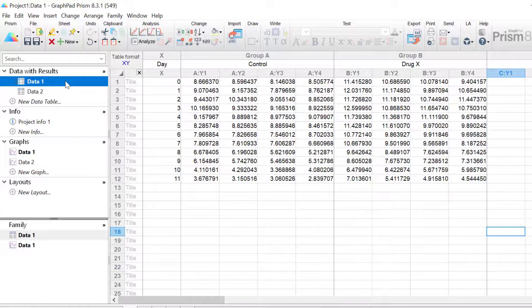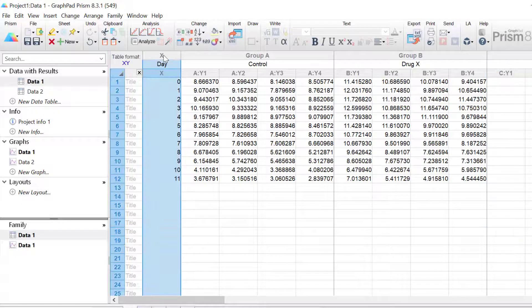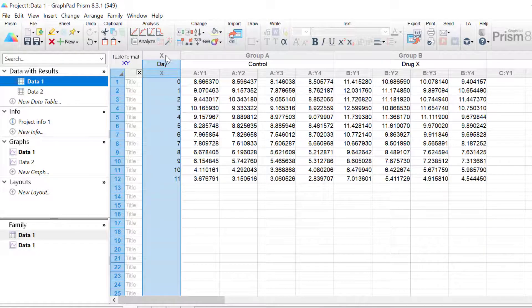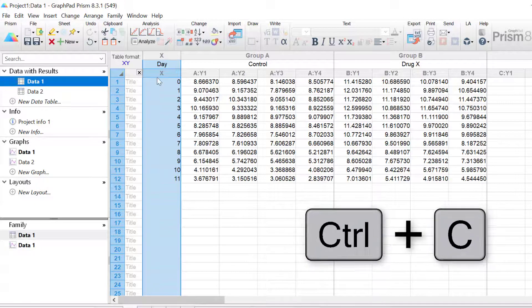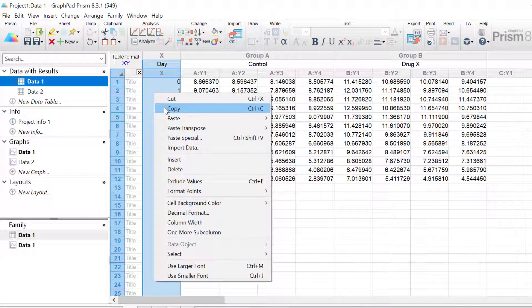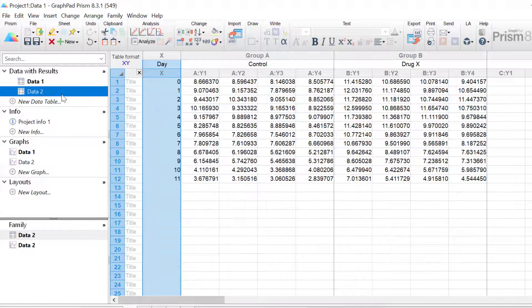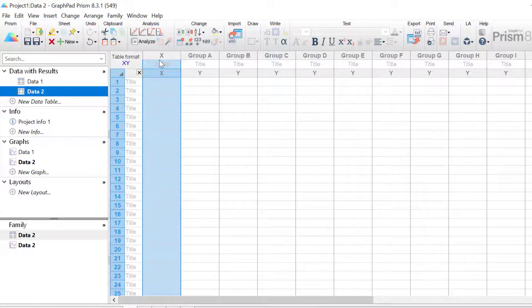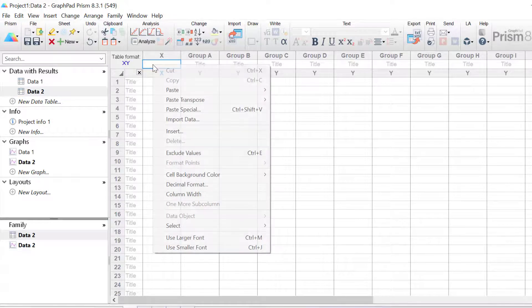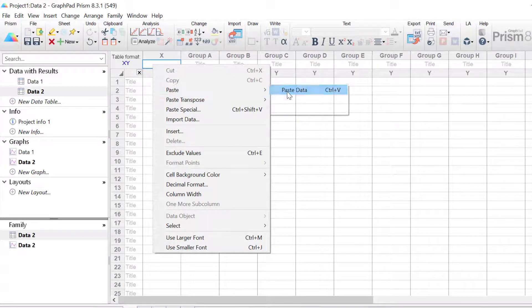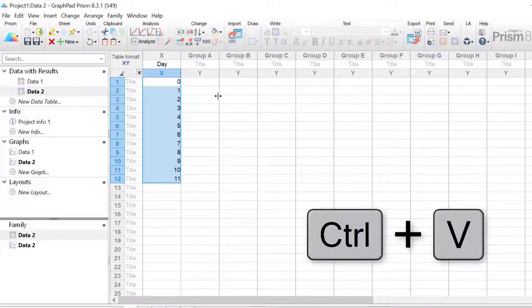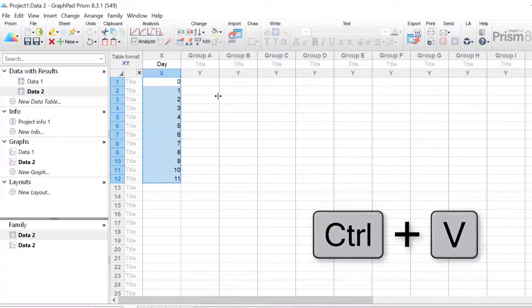I'm going to go back to my first data sheet and copy my X data by clicking on the column — you can either hit Ctrl+C as a shortcut on a Windows machine or right click and select copy. Now go back to the new data sheet, click on the X column, right click and select paste, then paste data. Alternatively the shortcut for paste on a Windows machine is Ctrl+V.